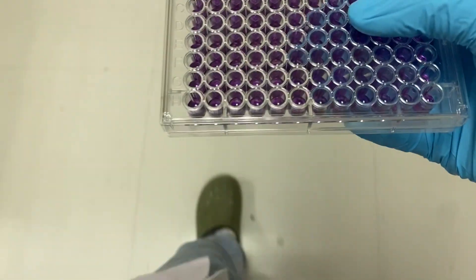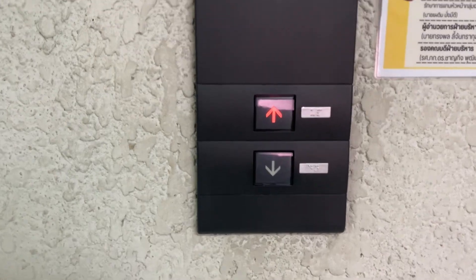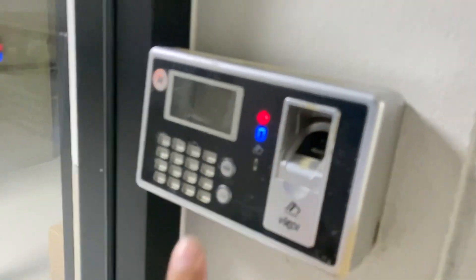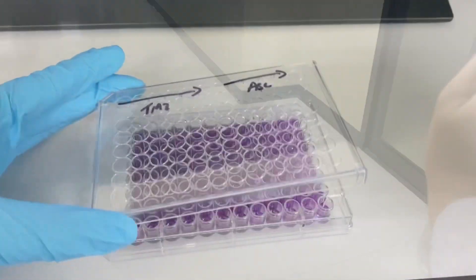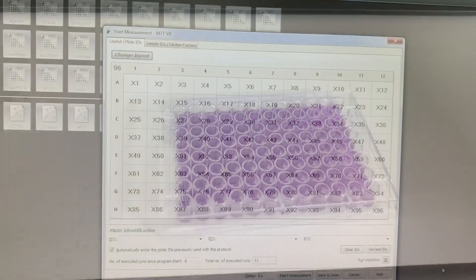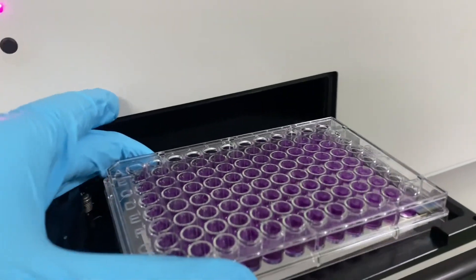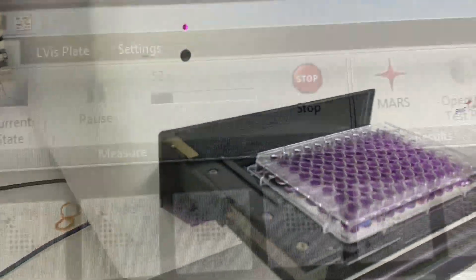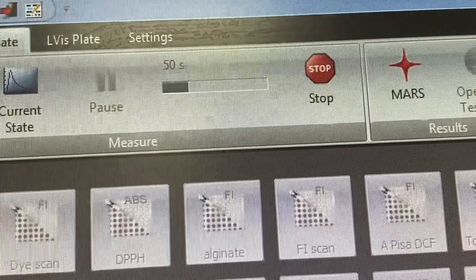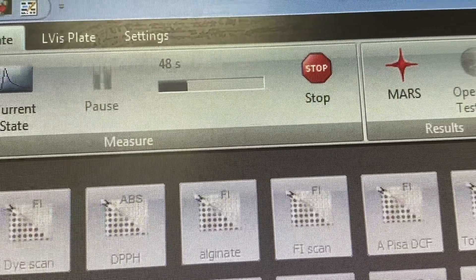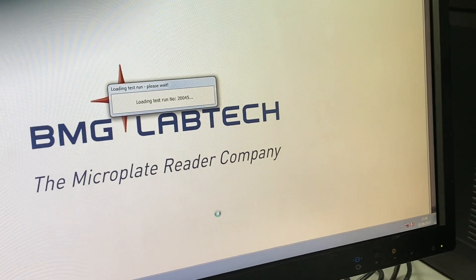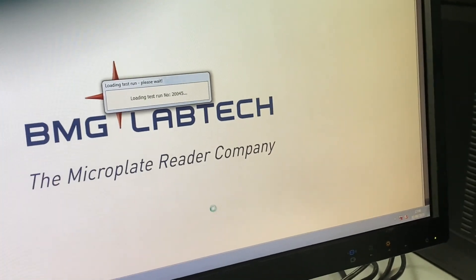Now I have to use the microplate reader, so I need to go to the eighth floor. I just took off my lab crocs and I'm heading up. After getting authentication for the eighth floor, you have to remove the lid before doing the absorbance readings, otherwise it will interfere with your readings. After that you manage your protocols and wait — it takes about 48 seconds and the software processes the data.